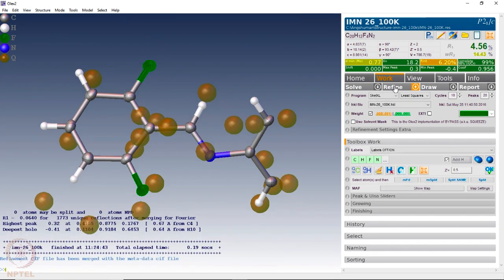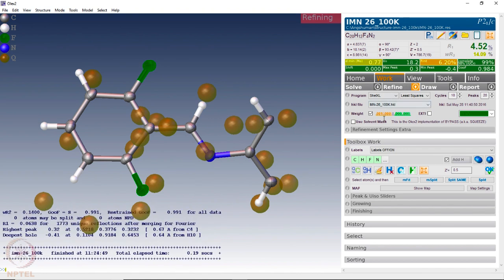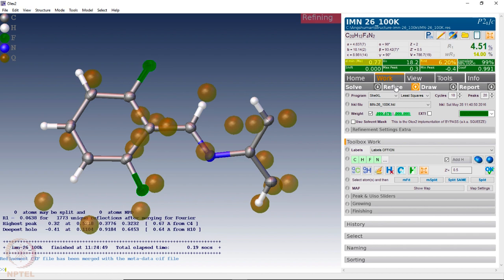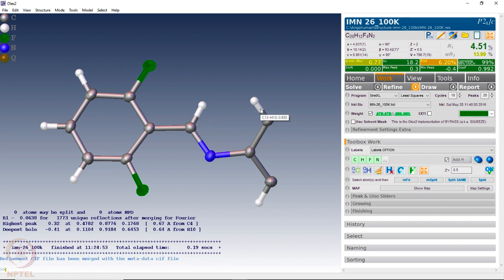After applying HFIX, one has to do a few rounds of refinement to reach convergence on the weighing factors, until you reach the lowest possible R-value for the structure. Now we can see that all the C-H bond lengths are the same — 0.93 angstroms — since all of them are single hydrogens connected to aromatic sp2 carbons, giving the same fixed bond length of 0.93 angstroms.